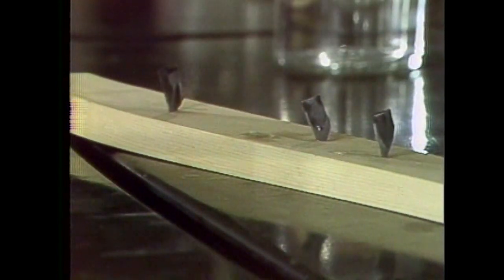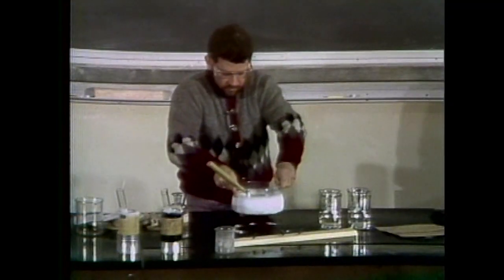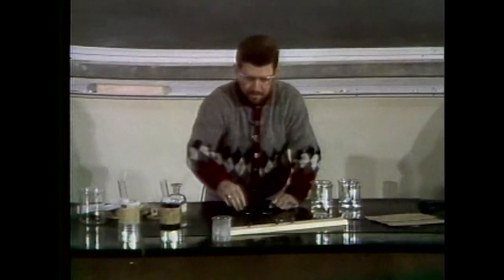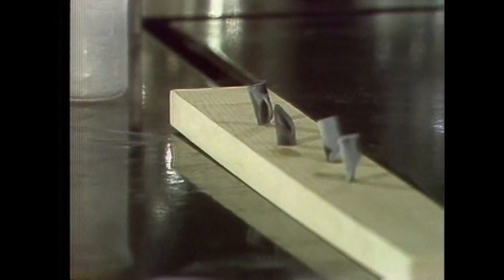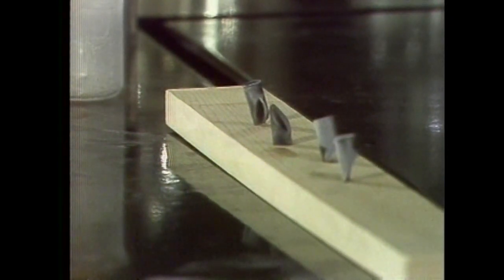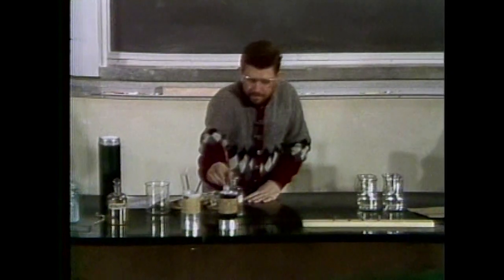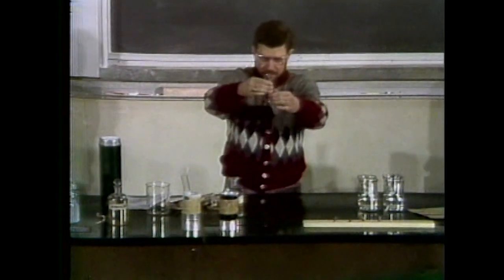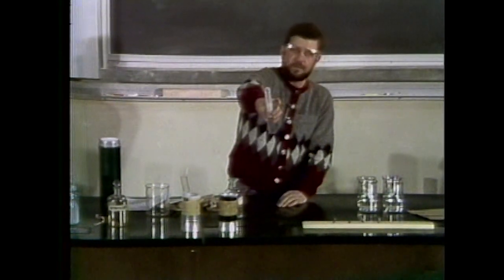Of course, the mercury is warming up, and so are the pieces of rubber, so I'll put the mercury back in the acetone dry ice slush here, and we can get rid of it, and let's see what happens to our spikes. Here's one that I didn't put through. I'll just leave it, let it sit there. And as we're waiting for those to warm up a little bit, let's see what has happened to our alcohol here. And you see that what we have is some hard liquor.